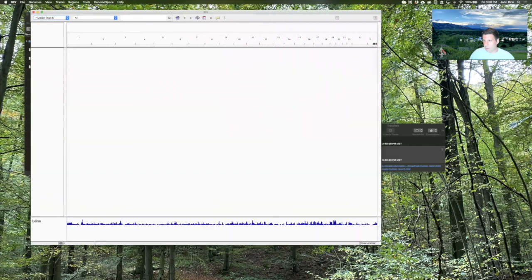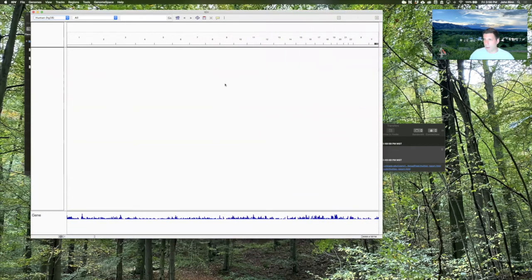And what you're going to see at first is just sort of a blank pane once you've installed IGV. It already has the genes, and it tells you which genome you're looking at here. We're looking at HG38, and that's where our data is. But if you are working in mouse or other species, there's a lot of data in there. But for now HG38 is where we're going to start, and I'll show you a little bit more of that. Here's where the coordinates are going to be, but for now, let's just load our files.